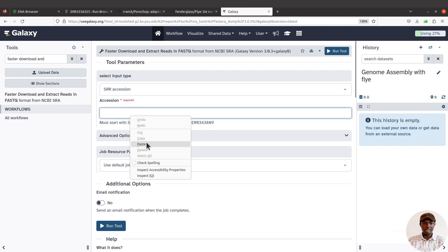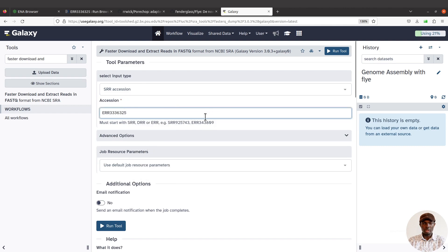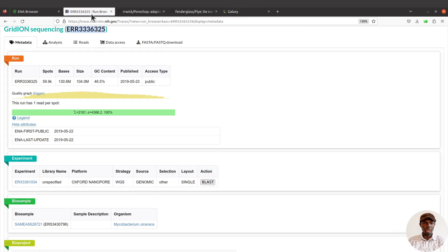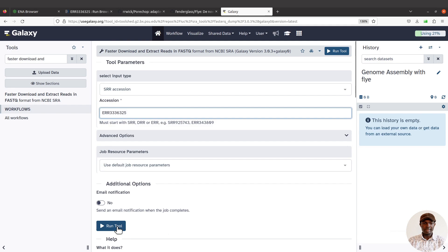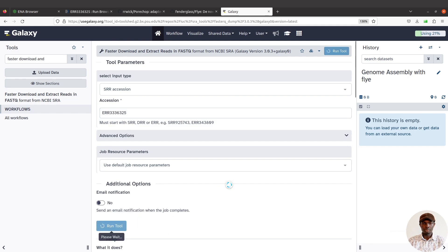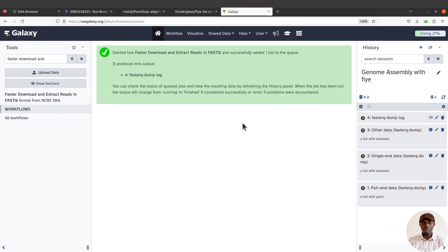After clicking, you get this interface. Make sure the input type is set to 'SRA Accession', then paste your accession ID here. There are also other approaches I've already covered in separate videos — check the description box for those. Just make sure you are using the correct accession ID, then click 'Run Tool'. Galaxy will begin to import the data and you will have a list of files coming up. Let's wait for everything to get imported.